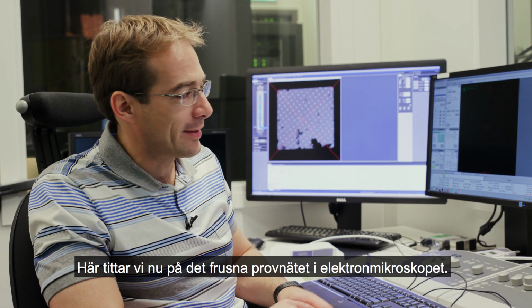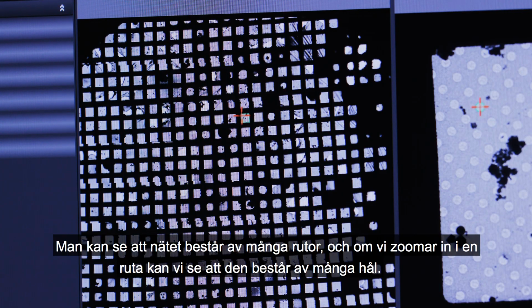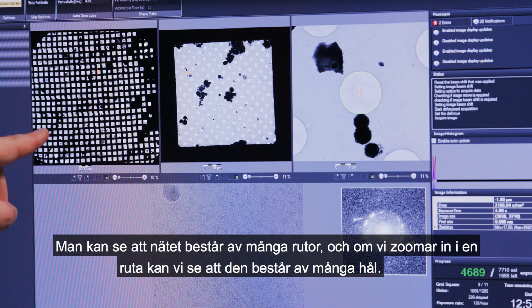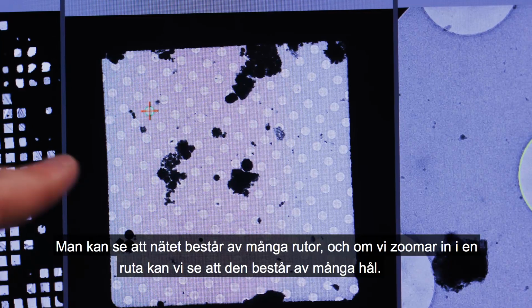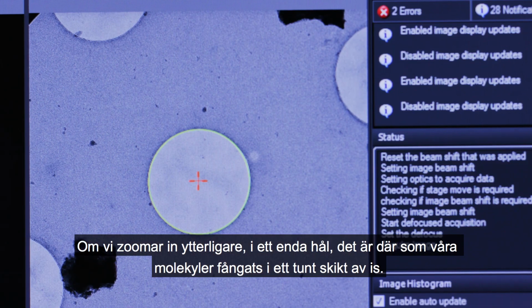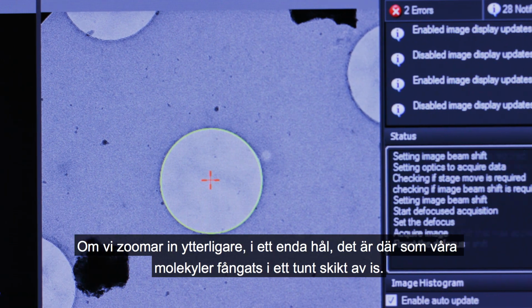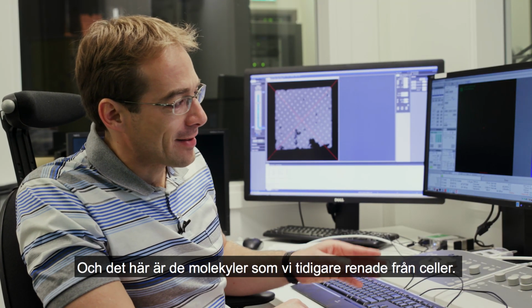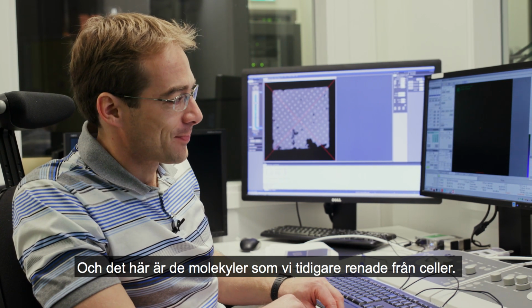So now we look at the frozen grid in the electron microscope. Now you can see that the grid is composed of multiple squares. And if we zoom in into a single square, we can see that it's composed of multiple holes. If we zoom in further into a single hole, this is where our molecules are trapped in a thin ice sheet. And those are the molecules that were previously purified from cells.